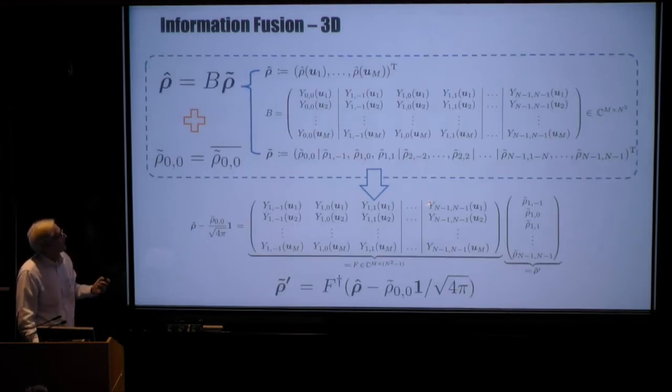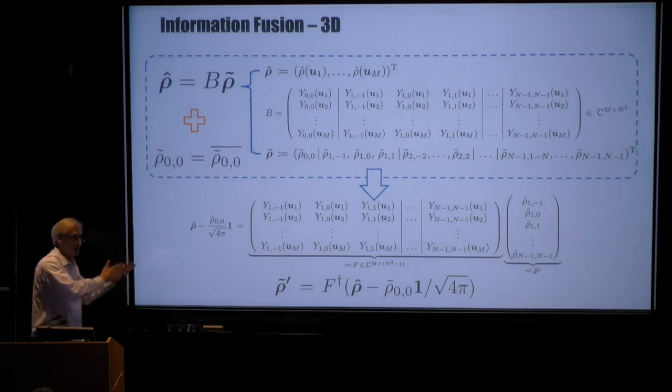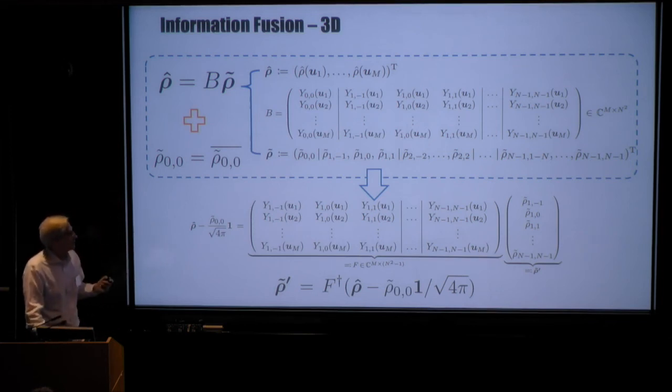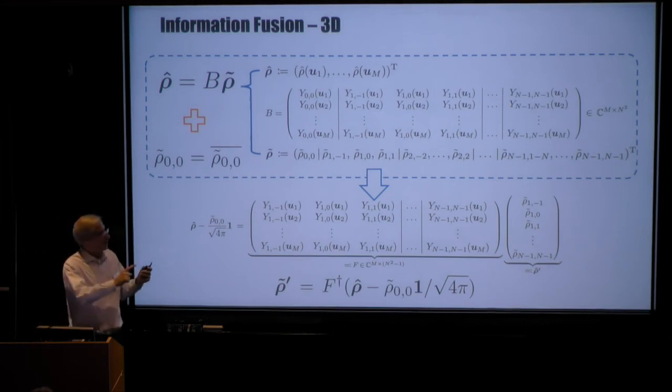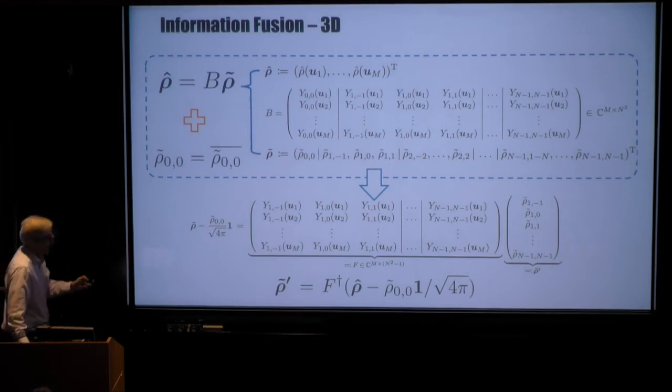And the intensity is just going to be related to the modulus squared of these coefficients summed over the appropriate indices. And now we're going to do in 3D space what we did in the 2D case before, where I had that column of ones and I extracted out this row 0 and solved a quadratic equation. We're going to do all of that again, except now the entries in these matrices are spherical harmonic values at the unit vectors on the unit sphere where you have data, okay, corresponding to the slices in Fourier space.